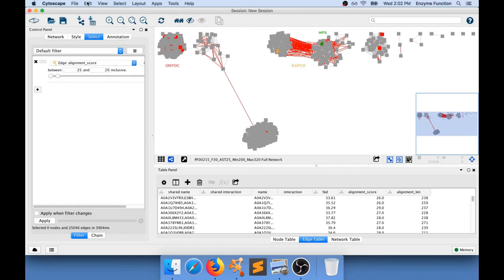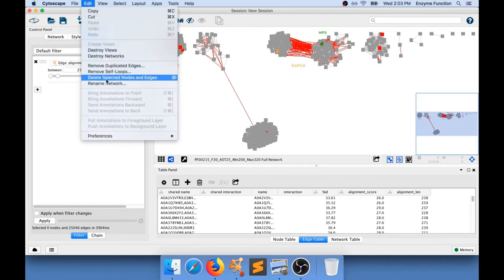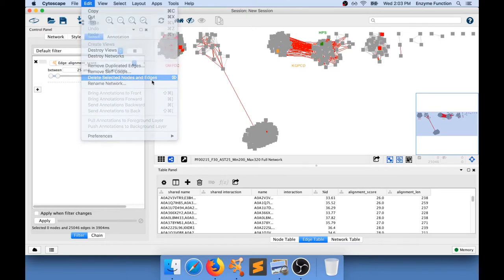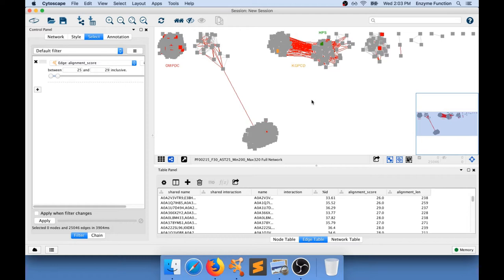And now what I can do is go to edit, delete selected nodes and edges. Once again I have only selected edges so if I do that I'm not going to remove nodes. This operation is going to take a little bit of time. But what I'm going to have now is a network in which the minimum alignment score is just going to be over 29. So we could consider 30.